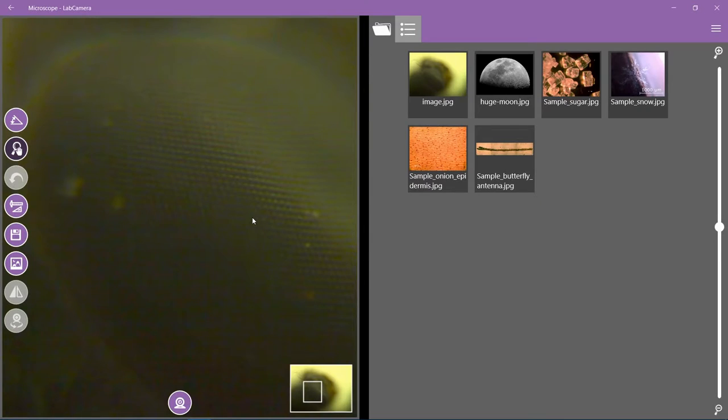Going back to the fly we have here, it would be interesting to see how regular these eye units actually are, so let's make some measurements on this one. To reveal some regularity in the shapes, I try to find some pattern in the angles, although it seems impossible to measure the eye units one by one. But if I measure the angles of these eye rows, it can be considered as an estimation.